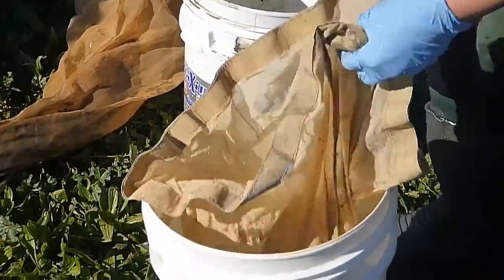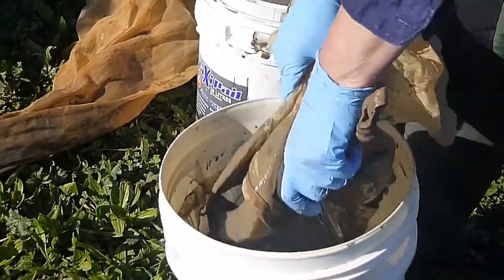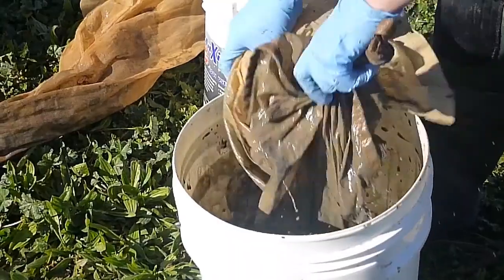Once all the sediment has come through, you then filter through the next net. This one is a 63 micron filter, which will allow us to collect the fine silt from the sediment.